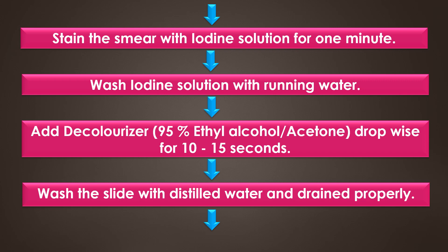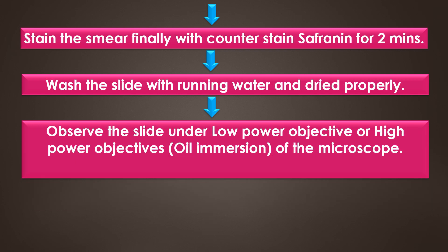Add decolorizer 95% ethyl alcohol or acetone dropwise for 10 to 15 seconds, until no more color flows on the smear. After the addition of decolorizer, wash the slide with distilled water and drain properly. Then stain the smear finally with the counter stain safranine for 2 minutes, and wash the slide with running water and dry properly.